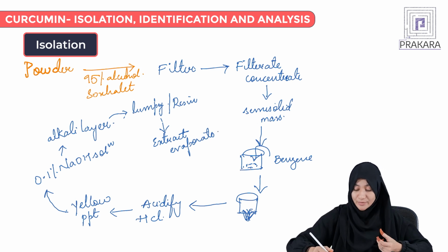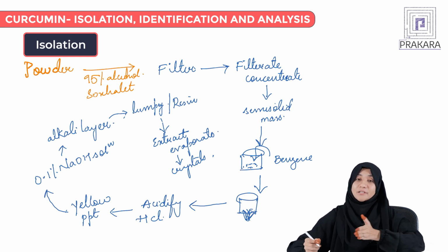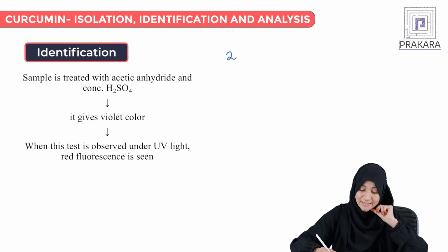After evaporating, you will see the formation of crystals, and the crystals formed are curcumin. Finally, in this way you have isolated curcumin. After isolating, you will go for the second step, that is identification.